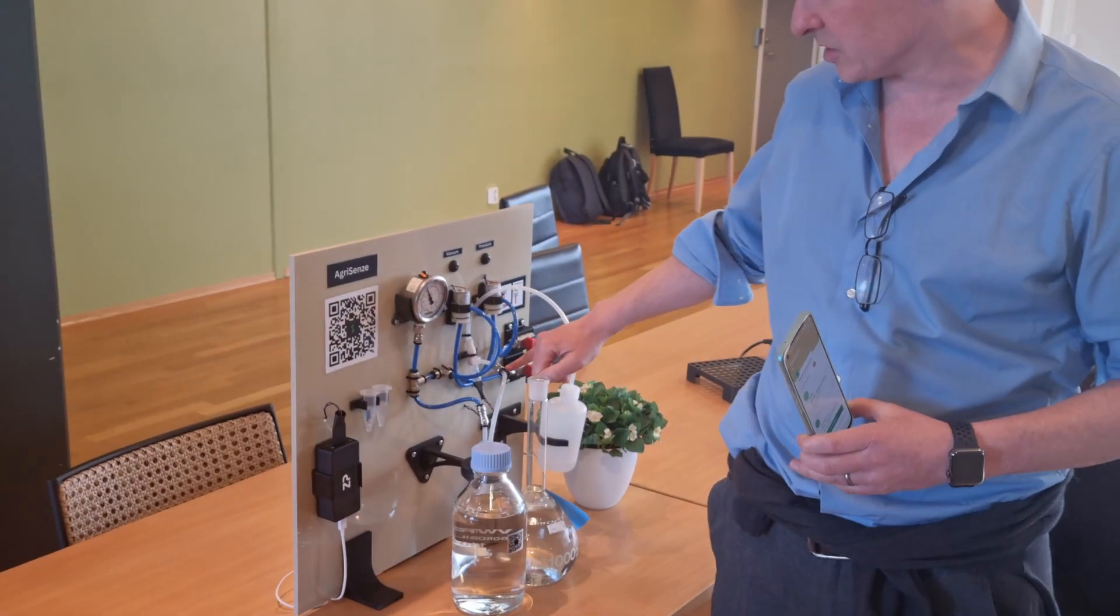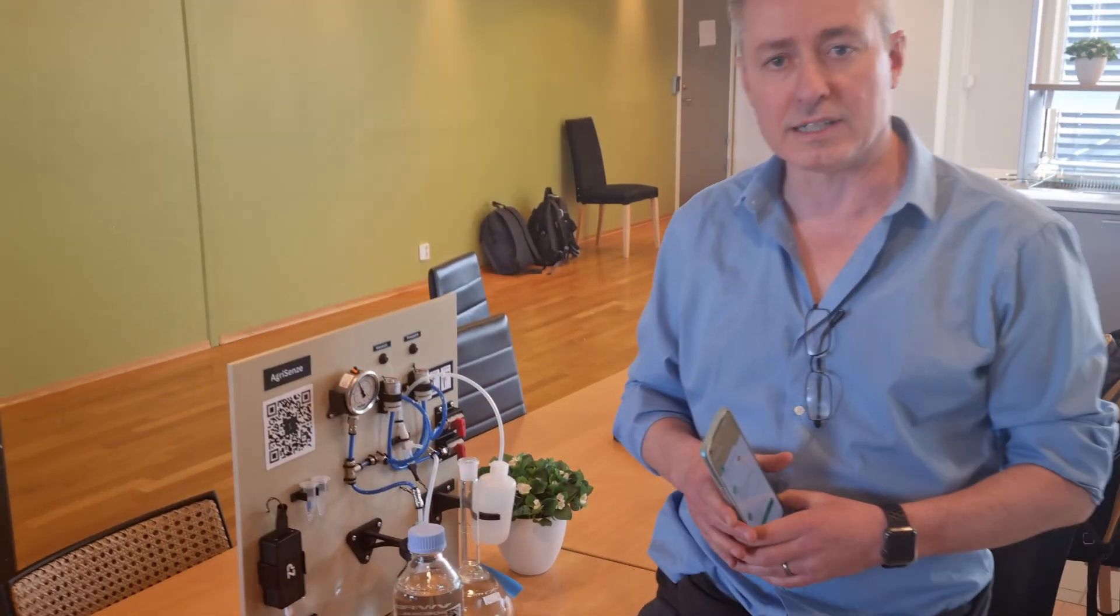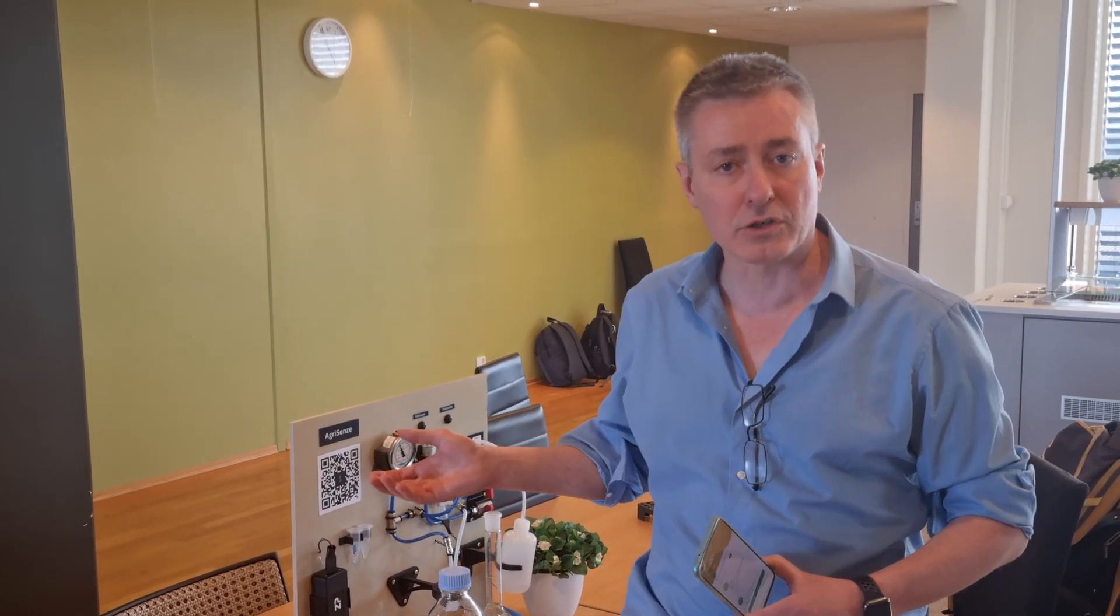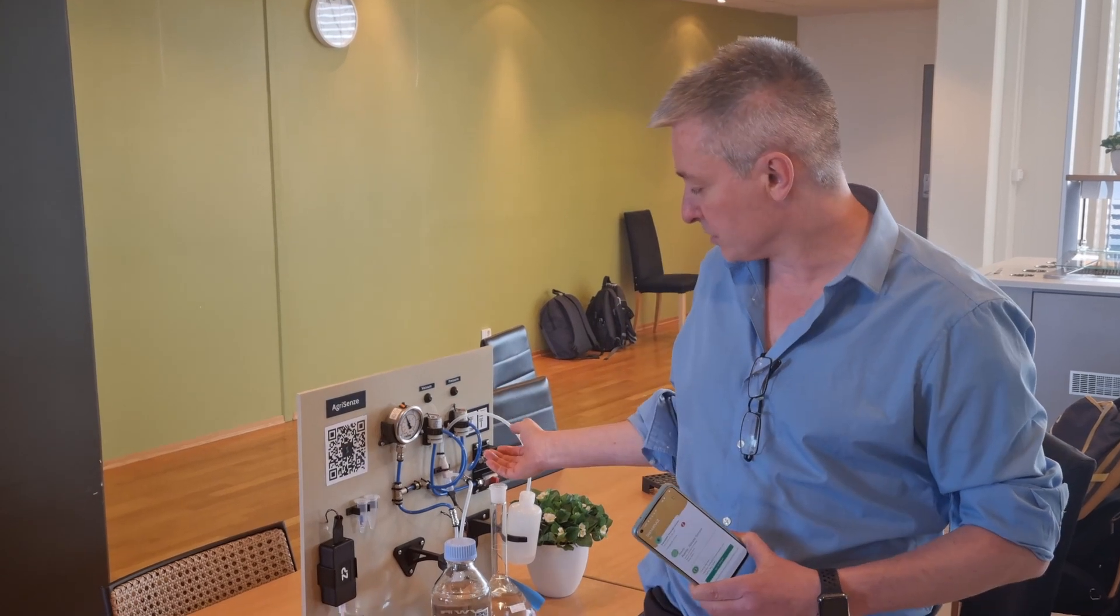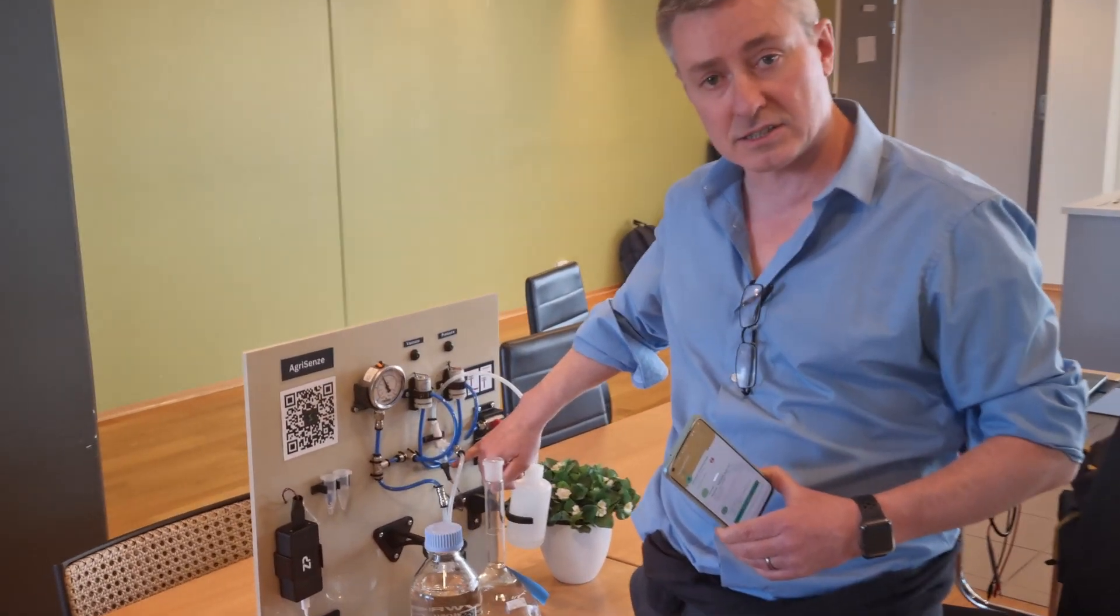It's hard for you to see but there's actually a sensor also on this rig. Now what this rig is demonstrating is that at ZP we can sense things often in the liquid phase. We can have samples, and like any good engineering company, we know how to pull that sample out of the reservoir, flow it over to the sensor, and there is a sensor in a flow stream here.